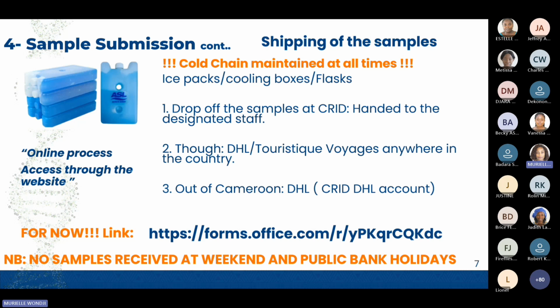So for those in Yaoundé or even in Cameroon, you can travel to Yaoundé and drop off your samples at CRID. This will be handed to a designated staff. You can also send them through DHL or this travel agency, touristic voyage, anywhere in the country. And if you are out of the country, we advise DHL.